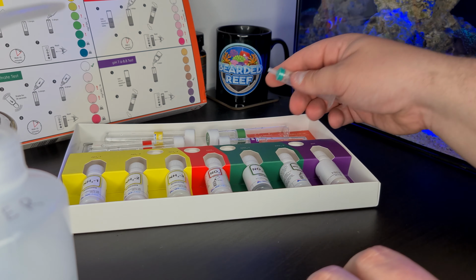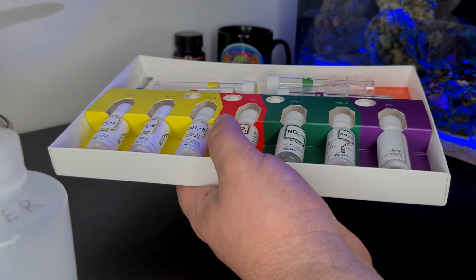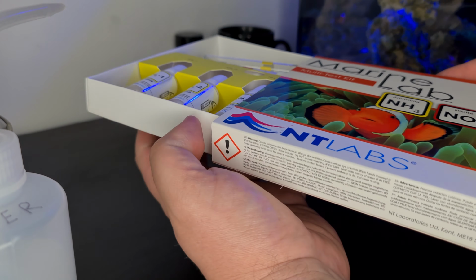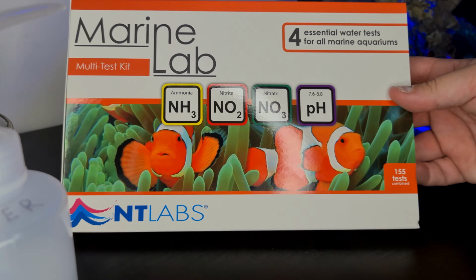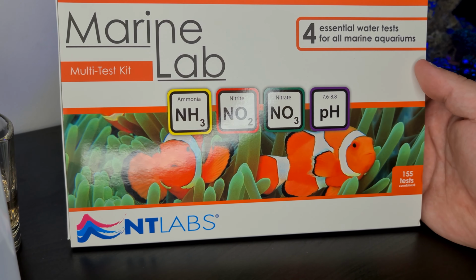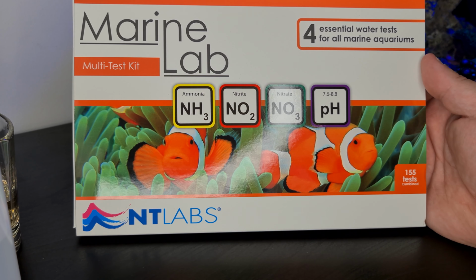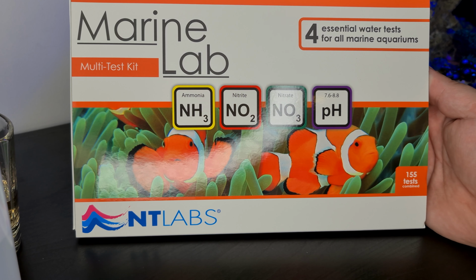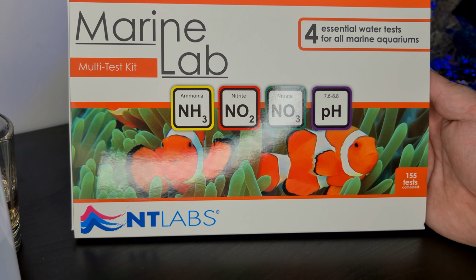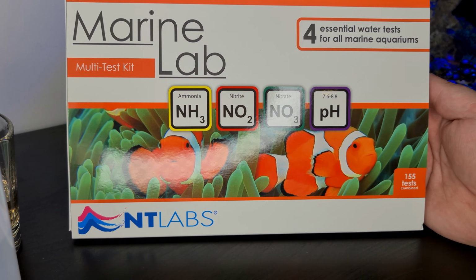Okay, so that's everything cleaned up. It's simply just a case of taking this slip again, sliding that over there, and that's it. That's the Marine Lab multi-test kit. Like I say, this is the first four, ammonia, nitrate, nitrite and the pH. So the second part will be obviously the other four, which does your alkalinity, magnesium, calcium and phosphate. So we'll do that one as part two.